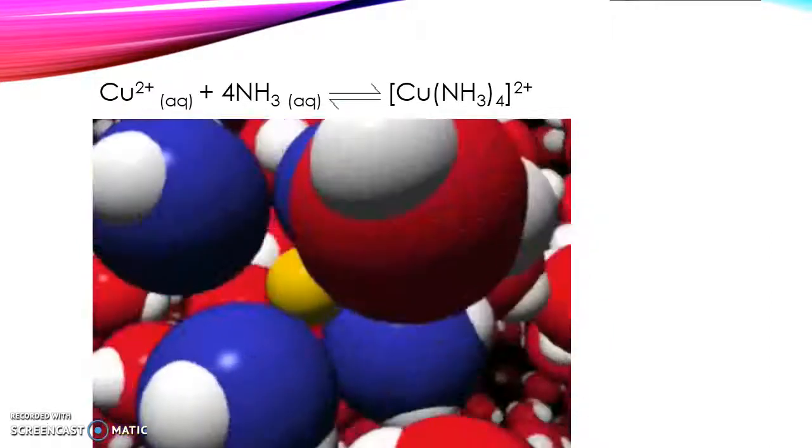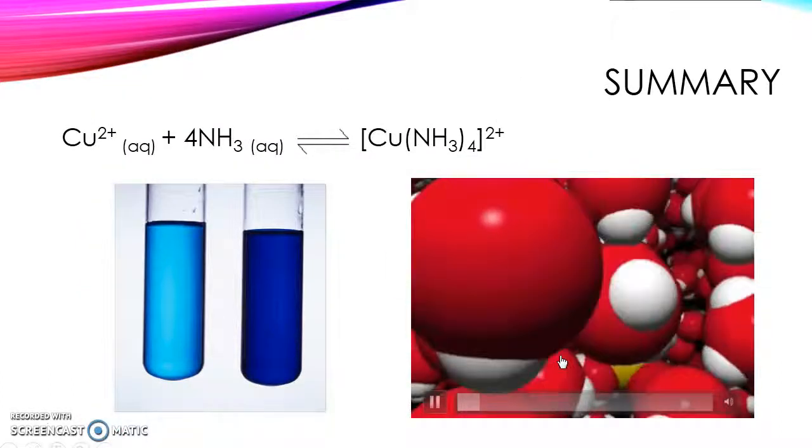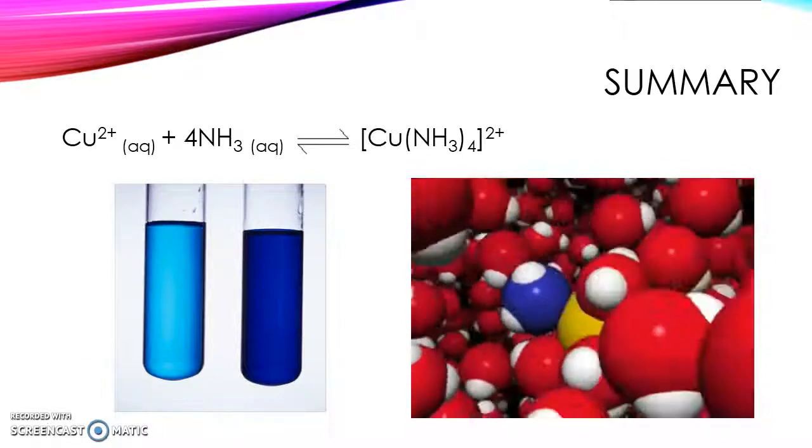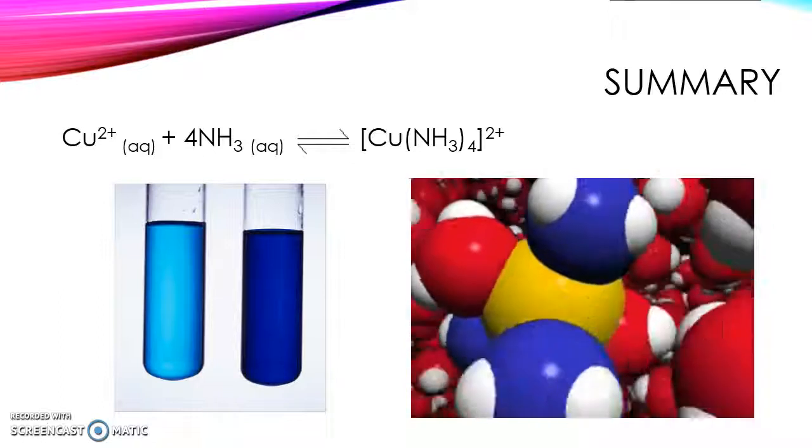So finally, in summary, the precipitate and dark blue colour formed when aqueous ammonia is added to a solution is strong evidence for the presence of copper 2+ ions.